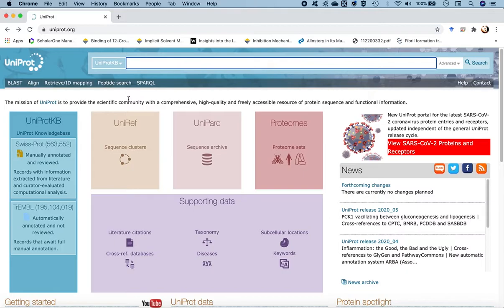Okay, so there are a number of software packages or applications that we can use to do the homology modeling. The most popular one being Modeller, whose web interface we saw in the previous tutorial, where we reconstructed the loop regions and then refined them by using the ModLoop function in Modeller by using the web interface. It's available as a standalone package as well.